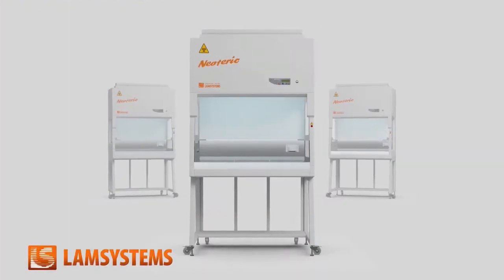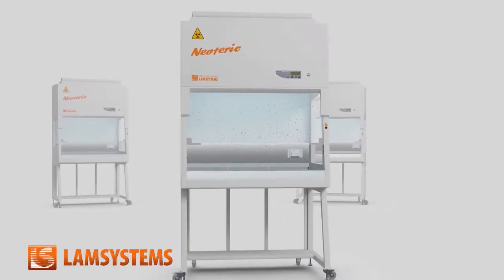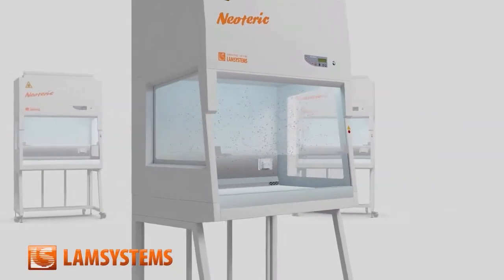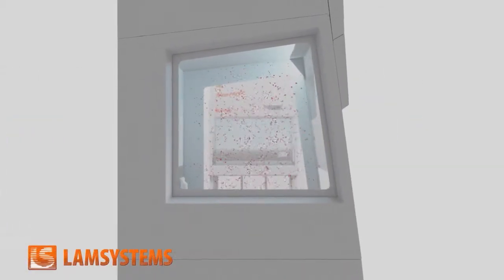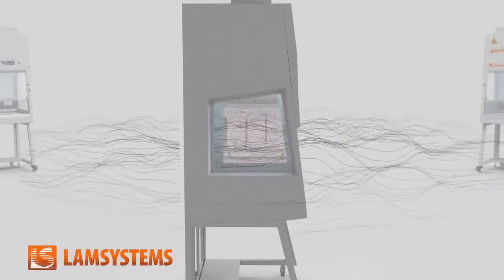The second-class biosafety cabinets provide personnel, product and environment protection inherent in work with airborne pathogenic agents and microorganisms. Microorganisms cannot move themselves, but if they join a dust or moist particle, they can move in the air, threatening to contaminate all living beings on Earth.